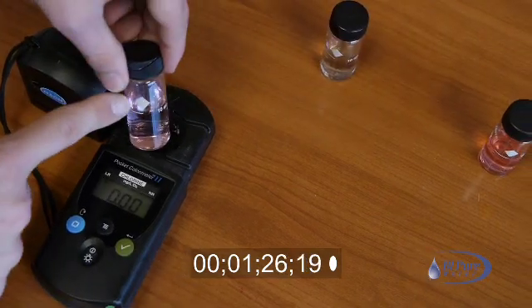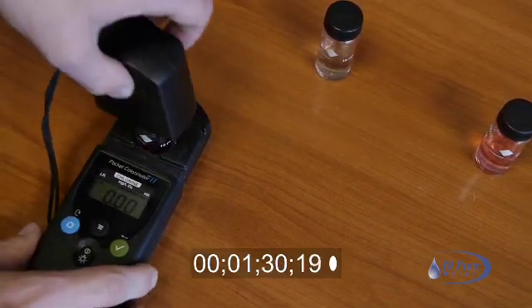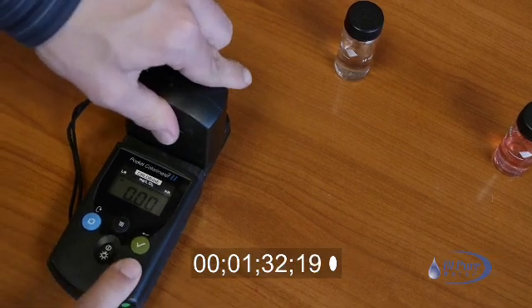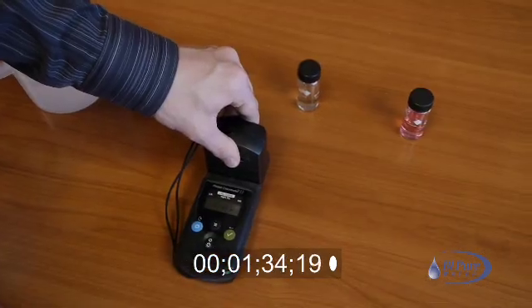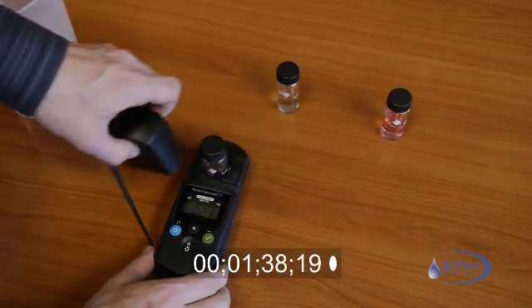Introduce the total chlorine sample, again with the diamond pointing at the instrument center. Put the measurement cap on and press the measurement button. The instrument will now indicate the total chlorine reading.